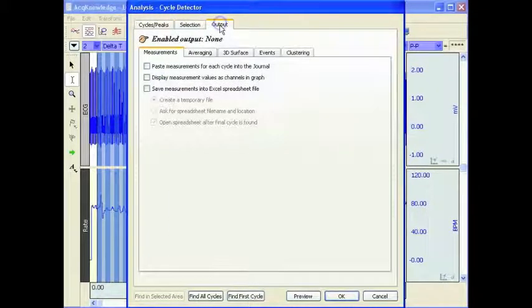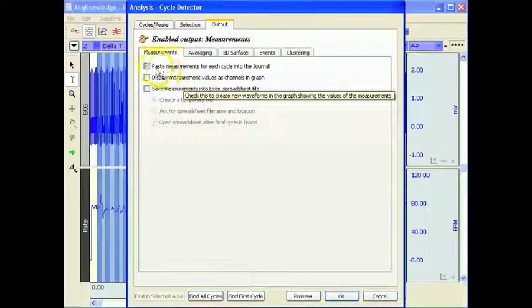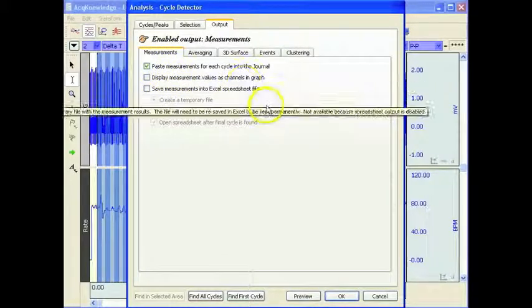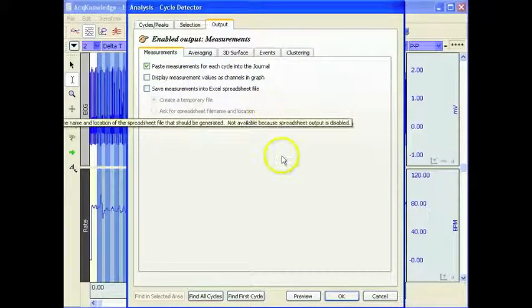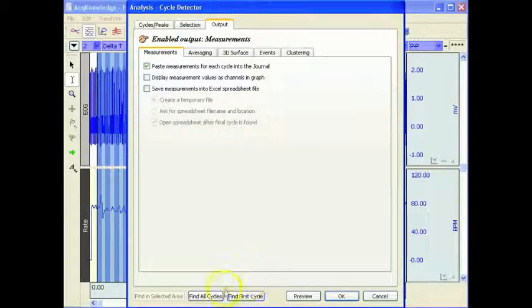I'm going to paste the measurement results down into the journal file and say Find All Cycles.